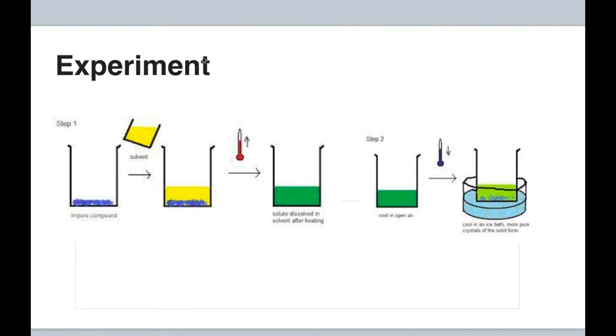Okay, just a second. Again, let's make sure we don't confuse ourselves, right? In the previous video, there were 5 stages, but you don't really necessarily show the same steps here. In step one, you are not choosing the right solvent, but you are already dissolving it. That's step two in the video. So let's make sure everybody who is listening to this video understands this slide is not showing the very first step. They are intending to show the experiment itself, not the testing for solubility as a part of the step.